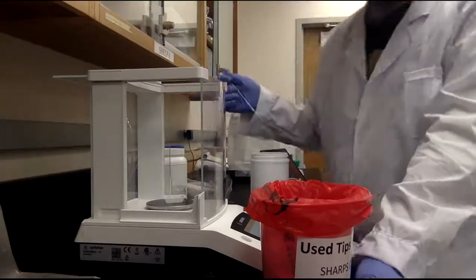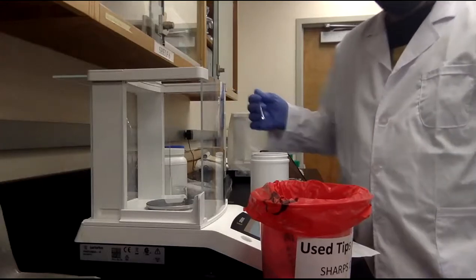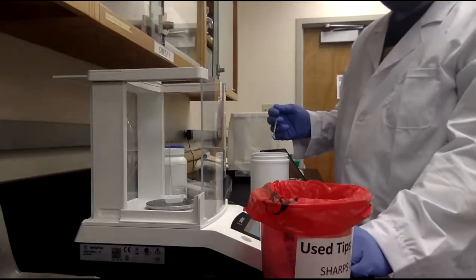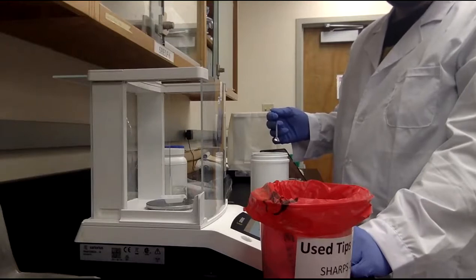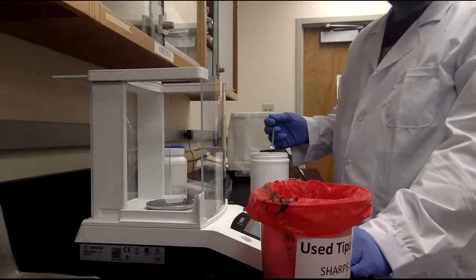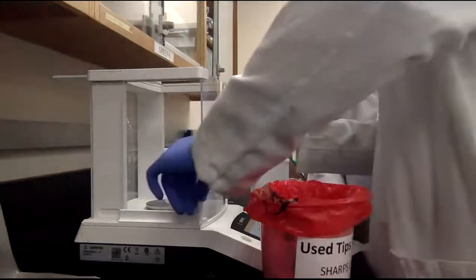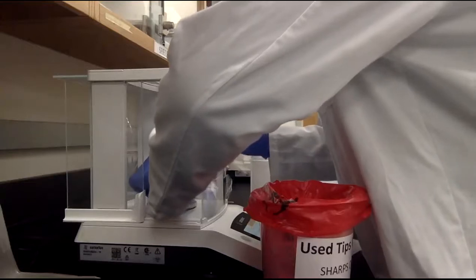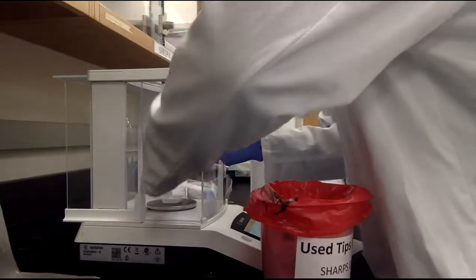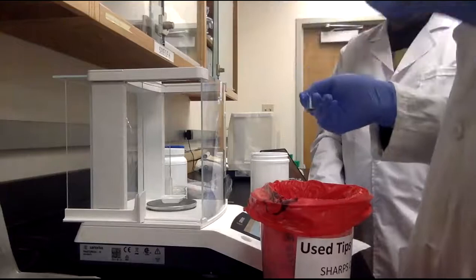So let me show you how to get this. Can I have the spatula? So when you are getting close, sometimes it's still more than what you need. You need 680, right?